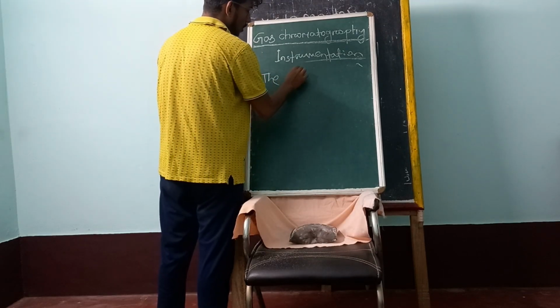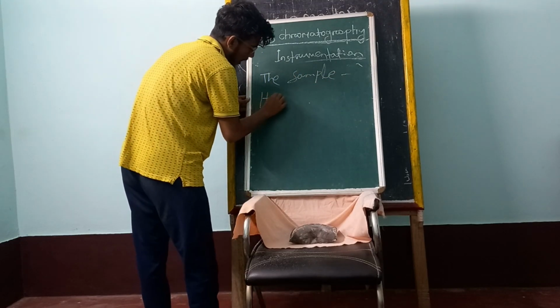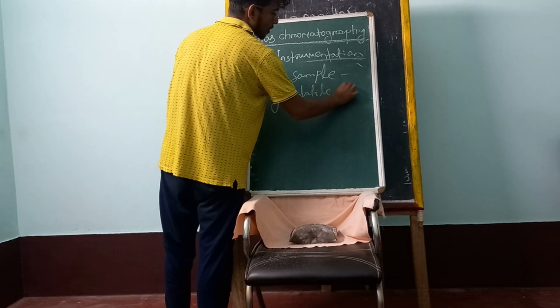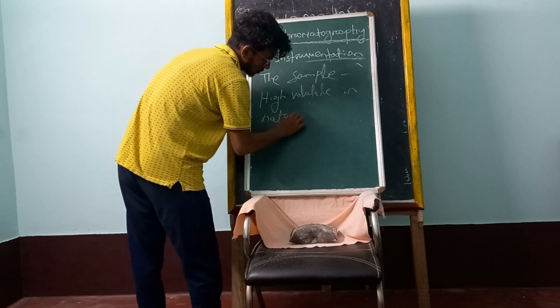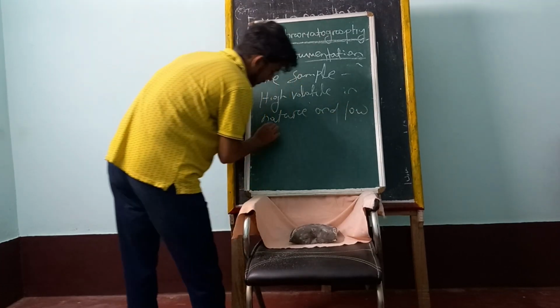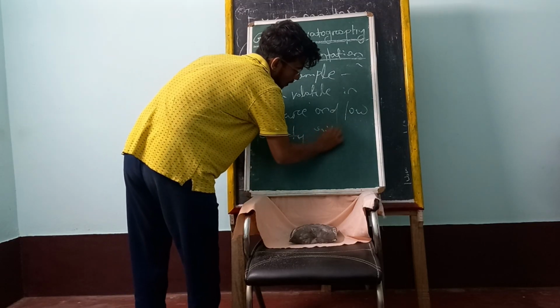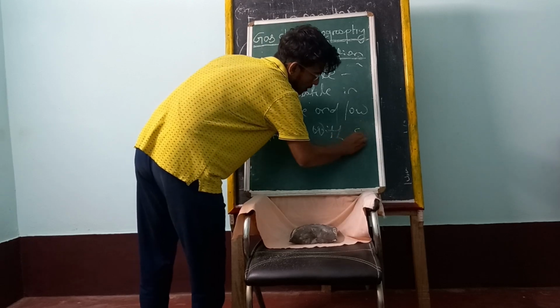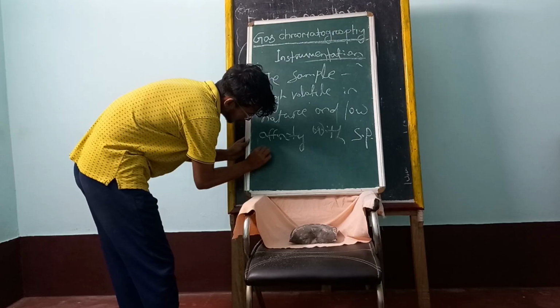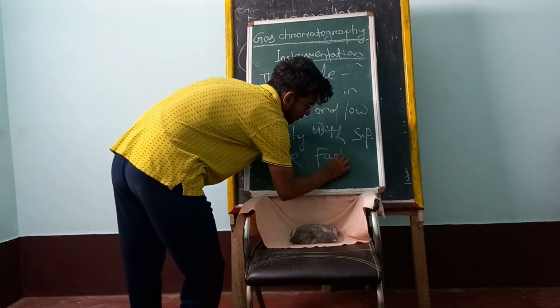The sample that is highly volatile in nature and has low affinity with the stationary phase elutes faster.